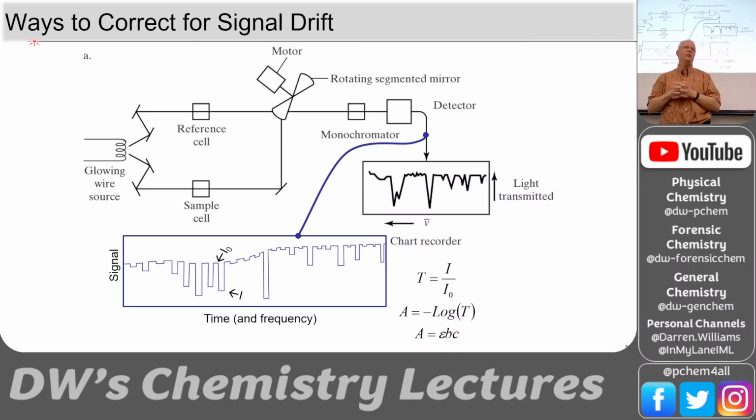So our spectrometer drifts. And did y'all have good luck with the Spec 20s? You did the Spec 20 experiments in Gen Chem? I see some sour faces. Do you remember the Spec 20? It's a little box, looked like a shoebox, and you had one little hole in there, and you put in your water, and you measure it to 0, right?